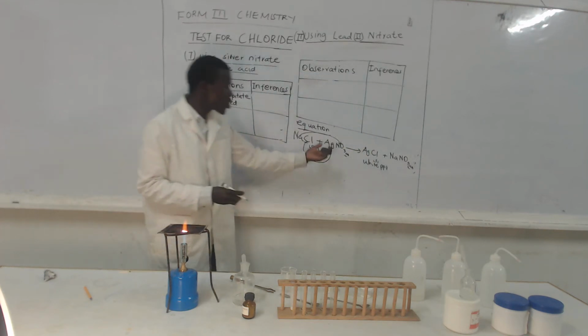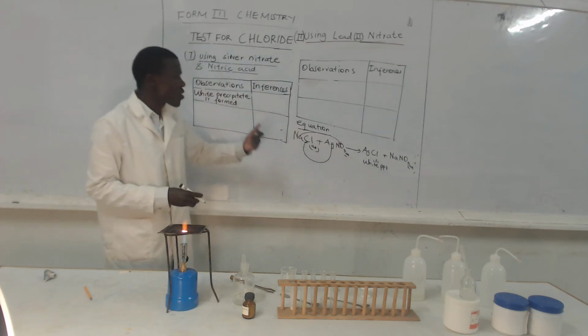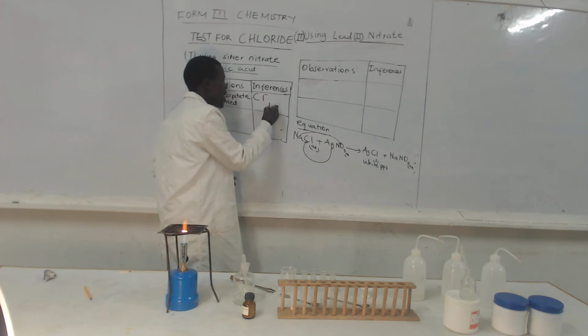Now the formation of silver chloride confirms that the sample contains chloride.